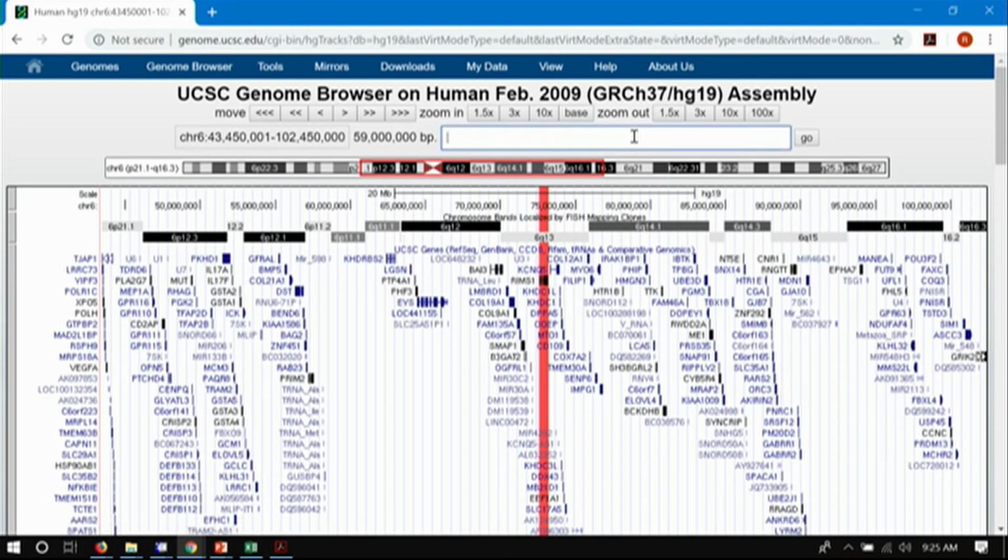Another thing you can do to navigate, and then we'll take a quick 5-minute break, is if you click here, you get this colon and hyphen and comma format to put in the browser. You can also copy and paste from something like a spreadsheet, where you can simply type in 6 and then 10 million, space, 11 million. And you don't need the punctuation at all.